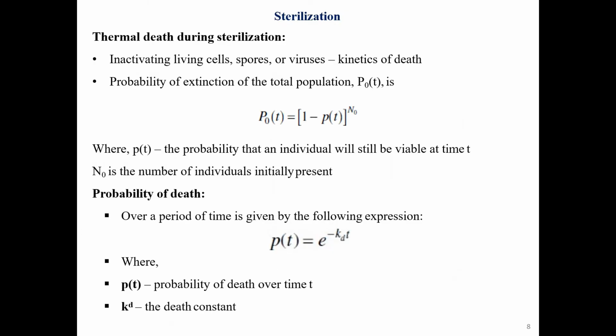So moving on, let's talk about sterilization. One of the important topics of fermentation is sterilization as well. There are basically two main types of this, so I'd like to discuss them before moving on. First is the removal of contamination, that is done by sterilizing. Sterilization is the first and foremost important thing to be taken care of in order to minimize the contamination rate. Sterilization is achieved through thermal death.